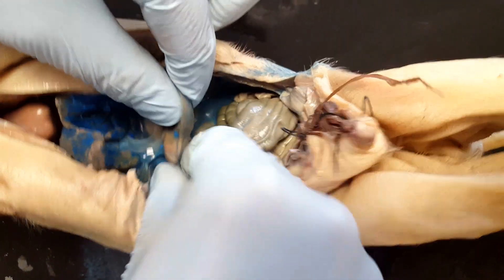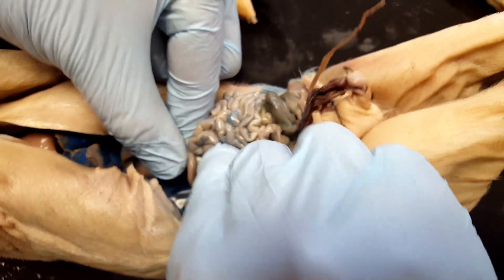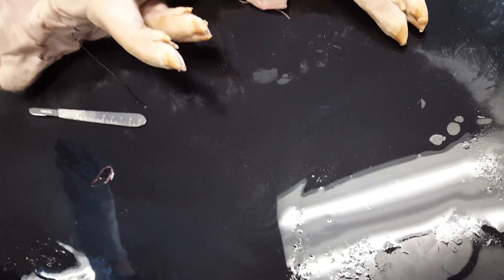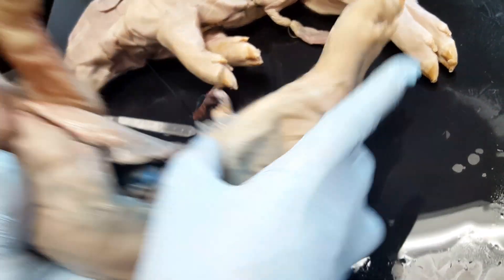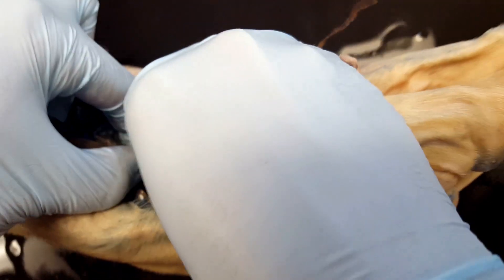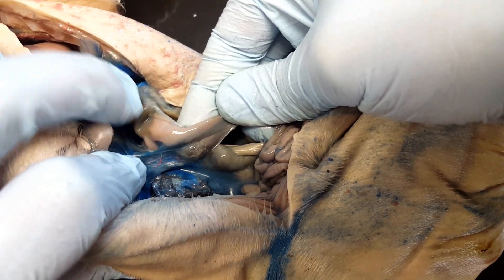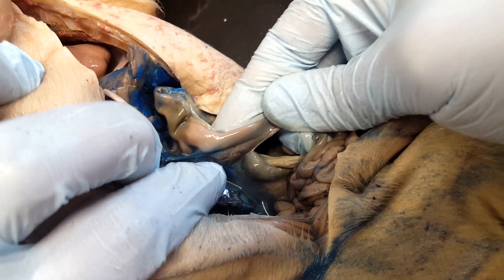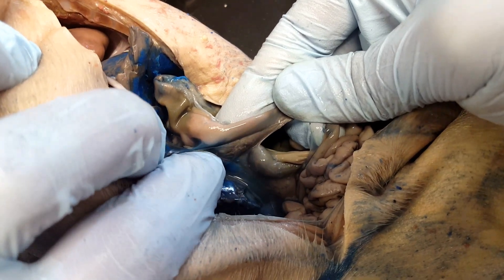If you look at the stomach, it's going to meet up with the small intestines at a part called the duodenum. Right where the stomach meets the small intestines is going to be the pancreas. Here with the moving finger is the stomach, and then here we see the duodenum — the beginning of the small intestines. Right below it is the spongy-looking organ, and that is going to be your pancreas.